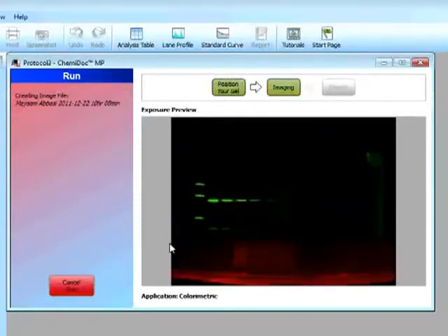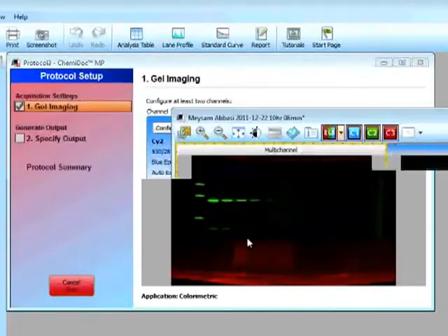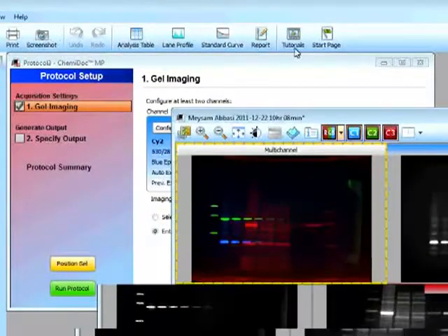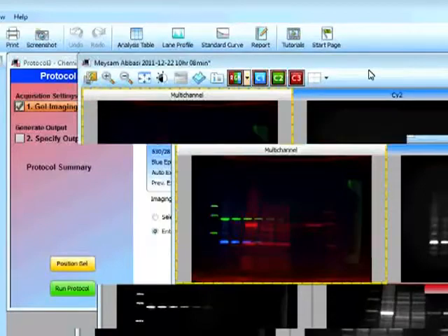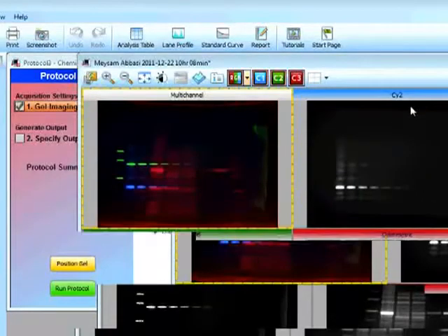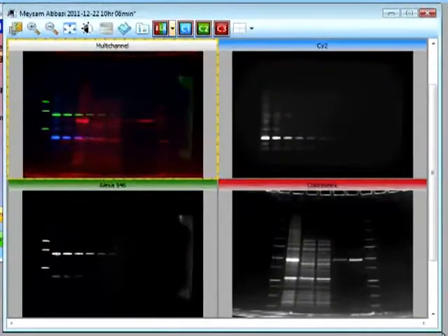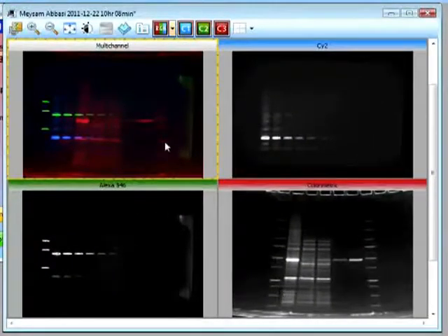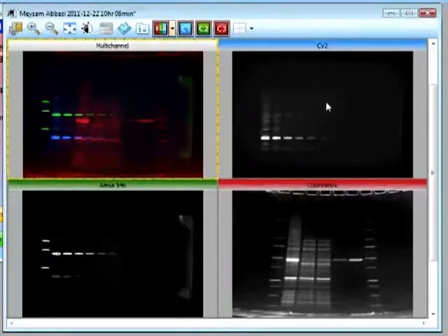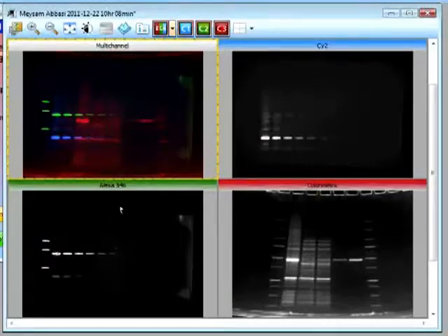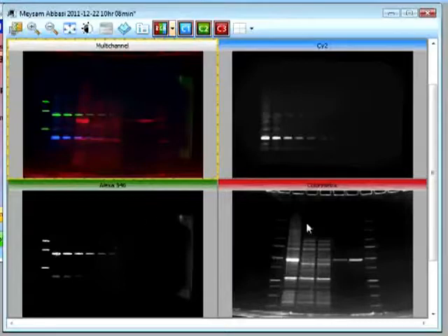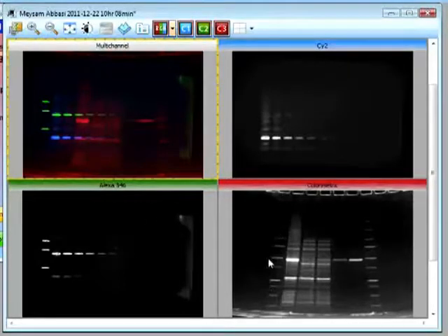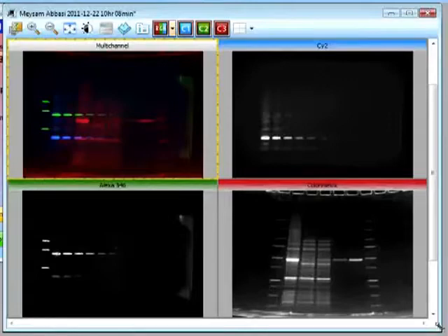So now we can first see the image from channel one, and then channel two, and channel three. So you can see that we have, in this view, we have the multi-channel image. We have the Cy2, Alexa 546, and the colorimetric, where we can basically see our protein standards.